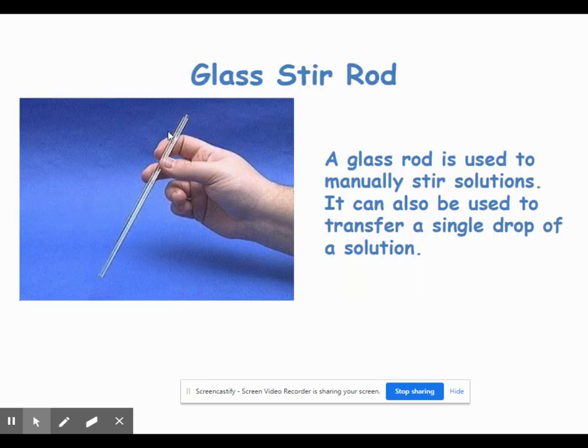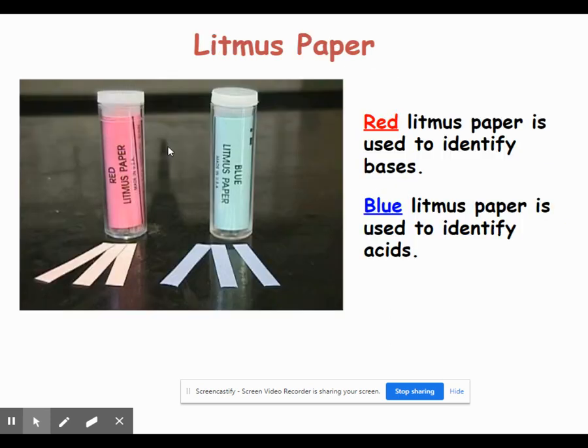A glass stir rod is just a long, thin piece of glass used to stir — it is the manual alternative to the magnetic stir bar.